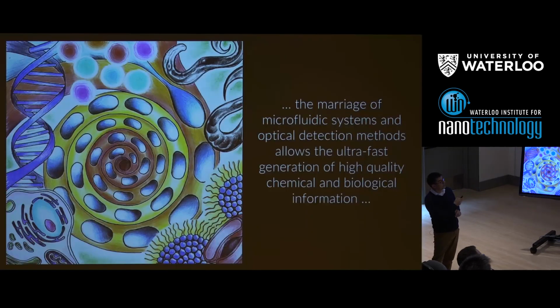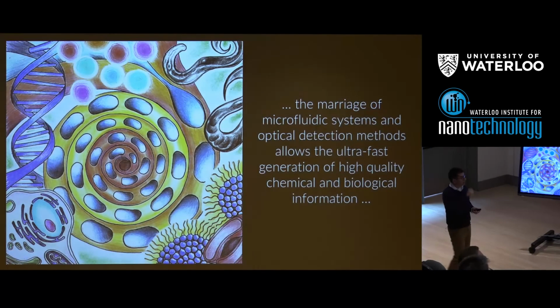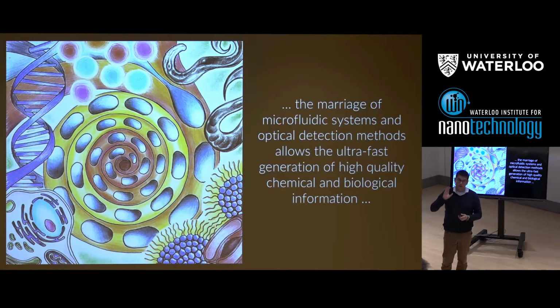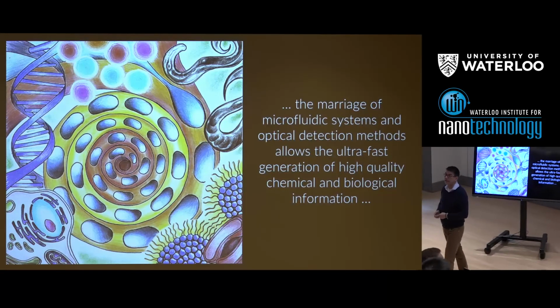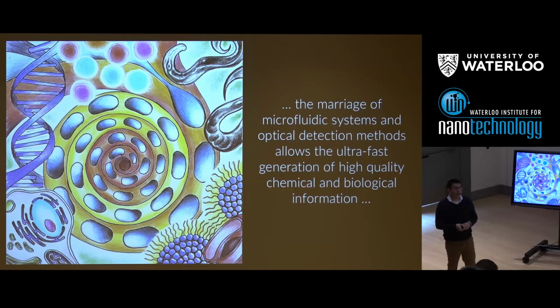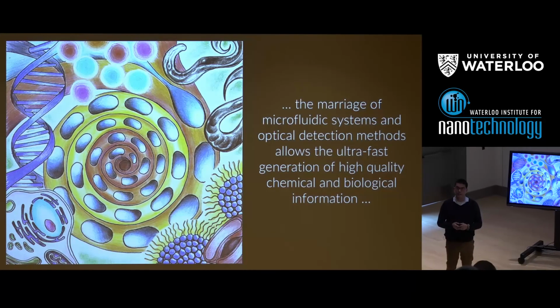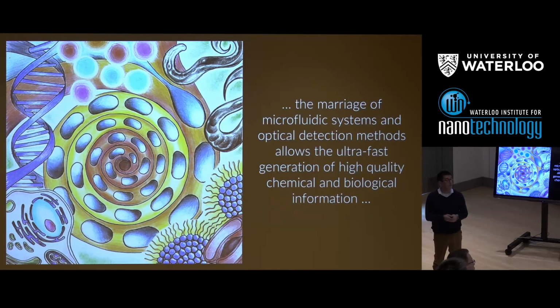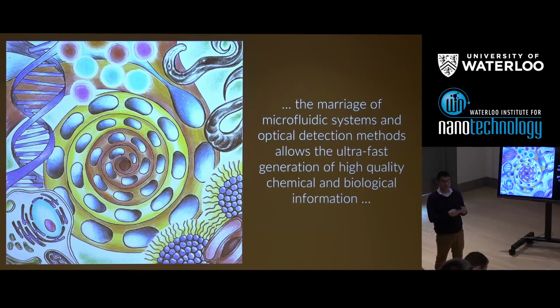So my final proper slide here is simply to give you a take-home message, at least from my point of view, and that's, I think the microfluidic systems, as I've seen very clearly here in Waterloo today, are very, very good at performing chemical and biological experiments. But really to utilize their power and take full advantage of their power, we need very good detection systems to really pull out that information.